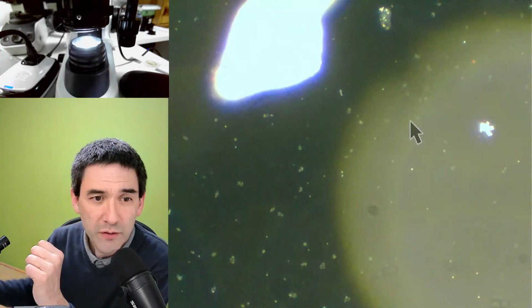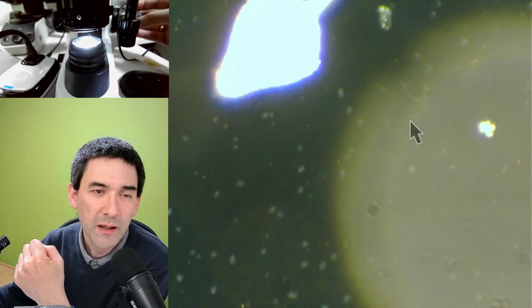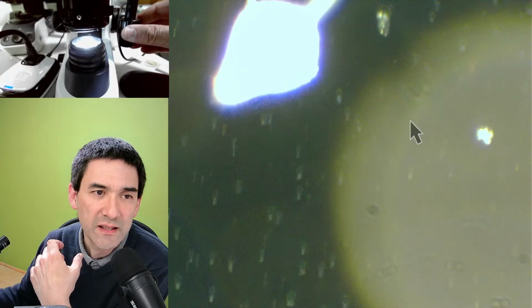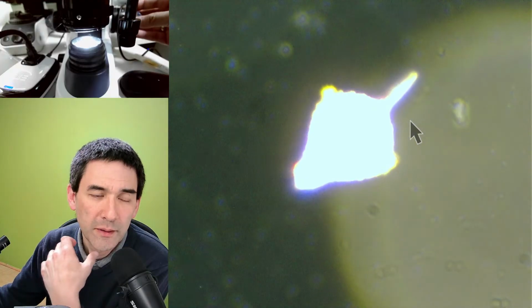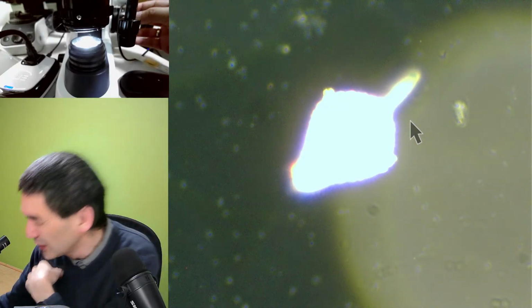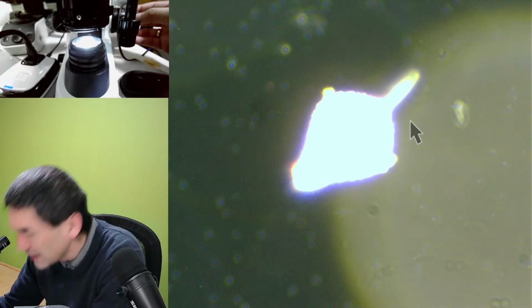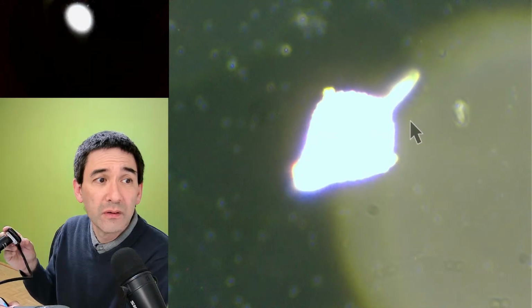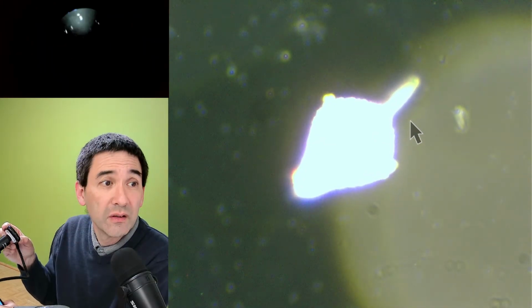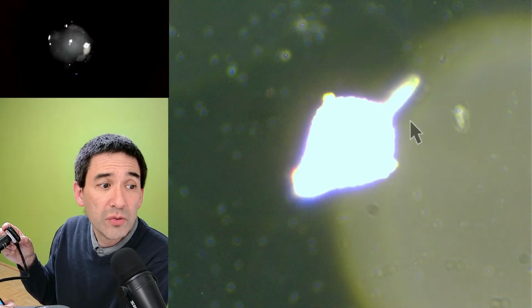So the 10 times over here, you see, that's a little bit the pity with the 10 times, because the camera thinks now that overall, because of the dark background, it overexposes. When you look through it, it actually looks very nice. You know what? I don't know. Does this work? Nah, unfortunately not. This doesn't work. I'm trying to use the camera now.